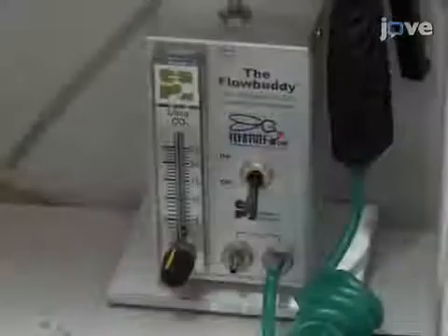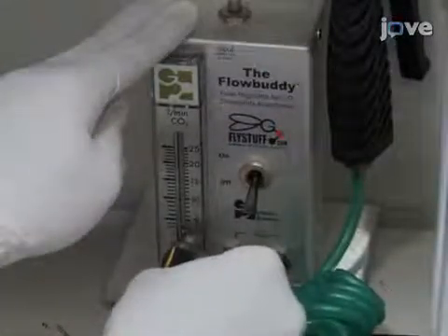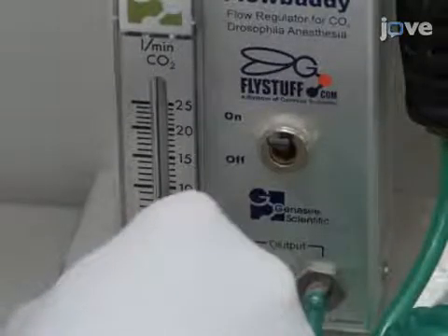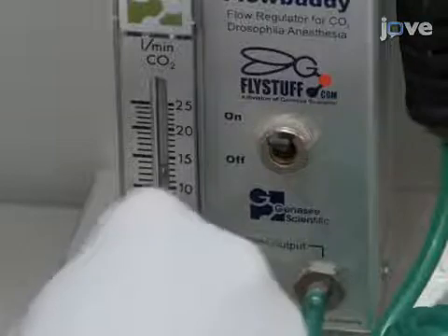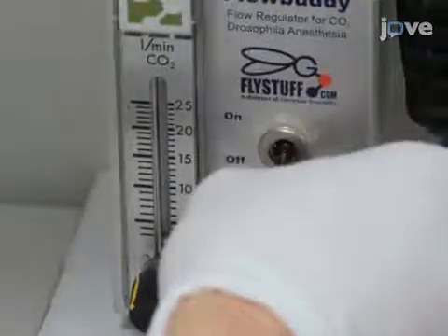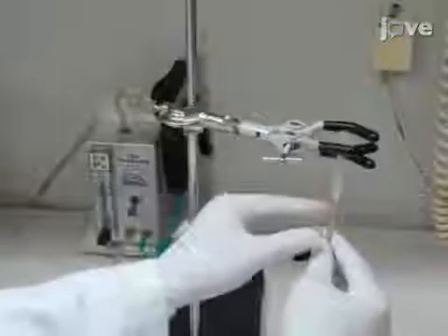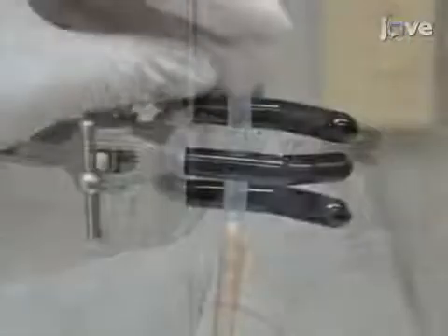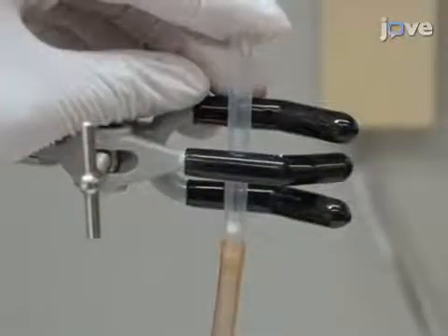To provide force, attach the syringe barrel to a carbon dioxide flow regulator. The regulator must have an on-off toggle switch and good control of the gas flow rate. Then clamp the barrel vertically to an iron stand, such that the impactor will fall to the bottom of the barrel.